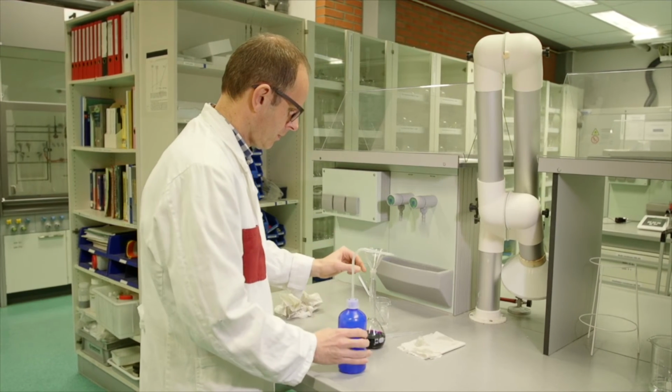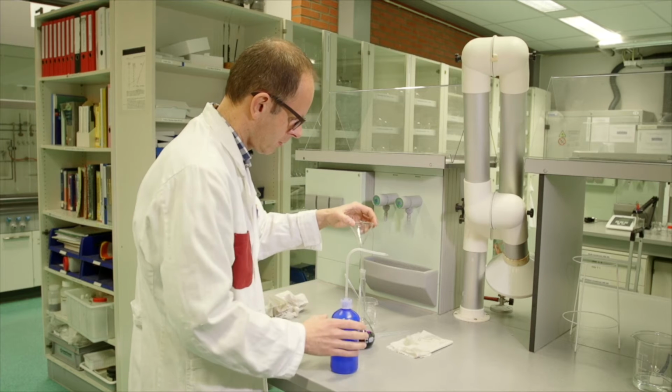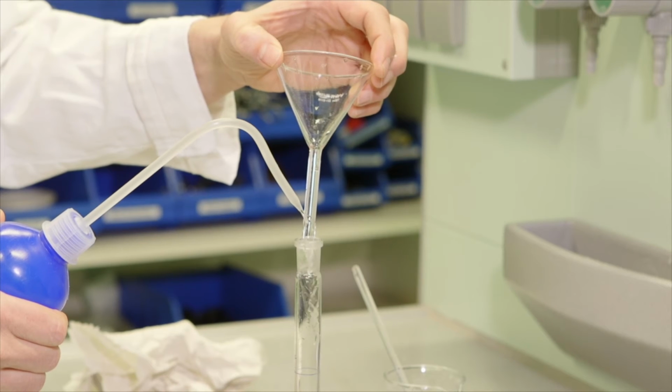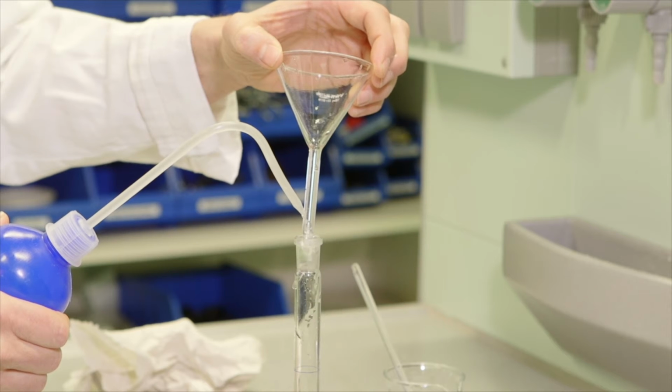The funnel is removed and the neck of the flask is rinsed with demi-water. Ensure that the tip of the squeezy bottle does not touch the measuring flask. The measuring flask is filled with demi-water to approximately 1 centimeter below the line.